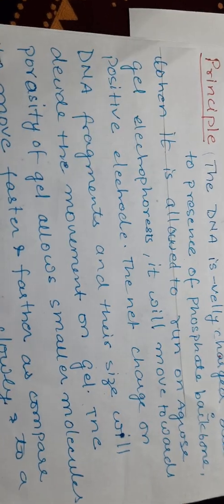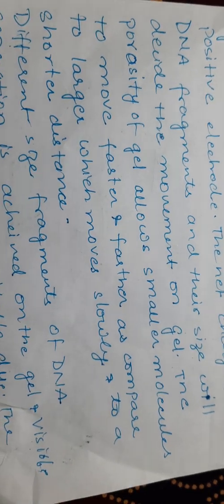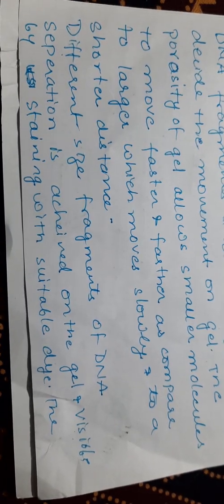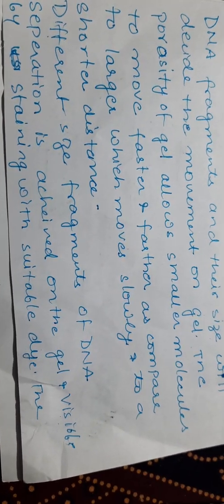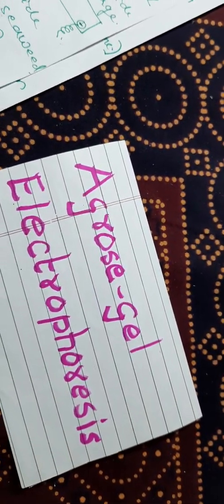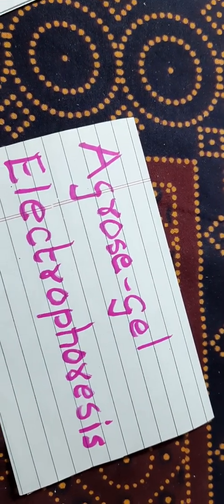The porosity of the gel allows small molecules to move faster and farther as compared to larger ones, which move slowly and to a shorter distance. Different size fragments of DNA are separated on the gel and made visible by staining with a suitable dye. So the DNA is visible in the form of bands. Now we will see the requirements and how this is done.